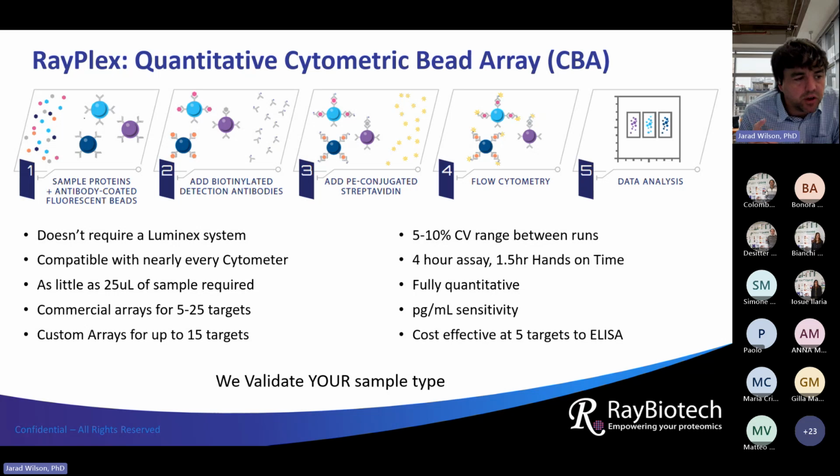Other reasons to consider it is the savings on sample. I can't stress enough. Like for some sample types, CSF, depending on the animal model you're working with or how young the model is, even serum plasma can be short on volume. It's a really good one to consider.